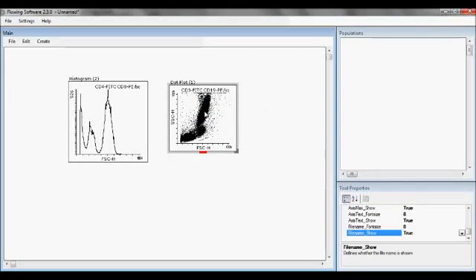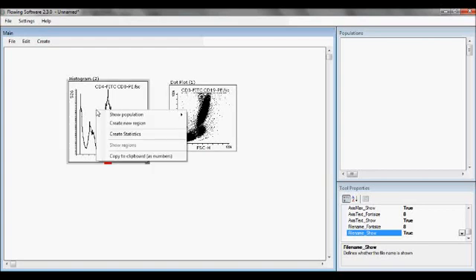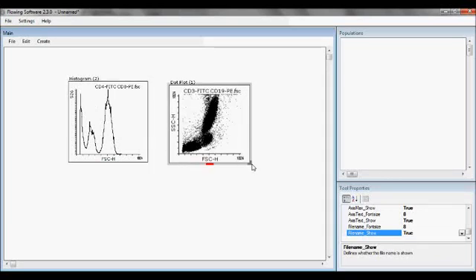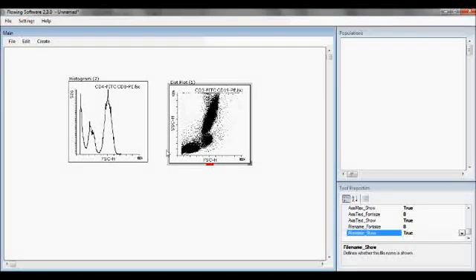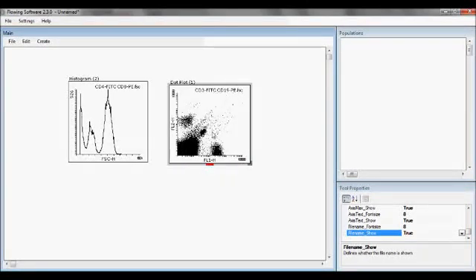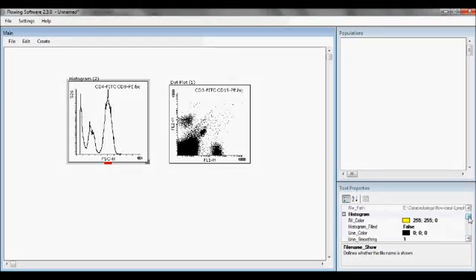and features, and different tools have different pop-up menus. And also, if you have an axis in the tool, for instance these two have this axis, then right clicking the axis name you can select which parameter you would like to see. If you have just one tool selected, then tool properties is also available.